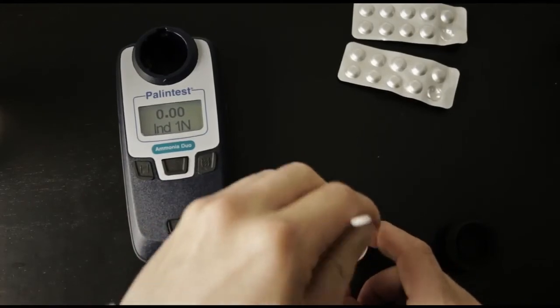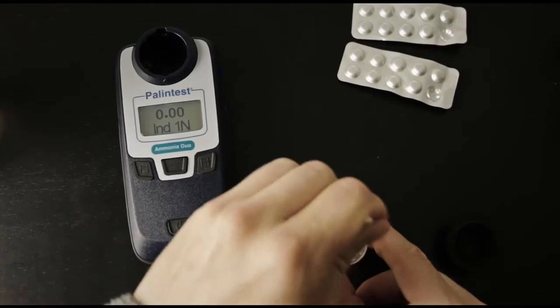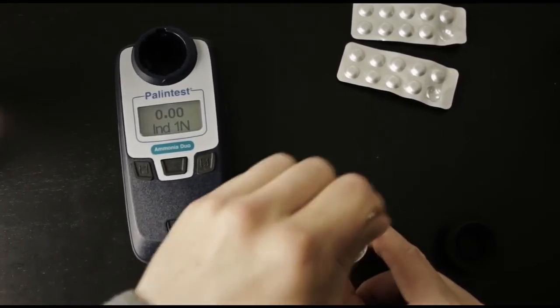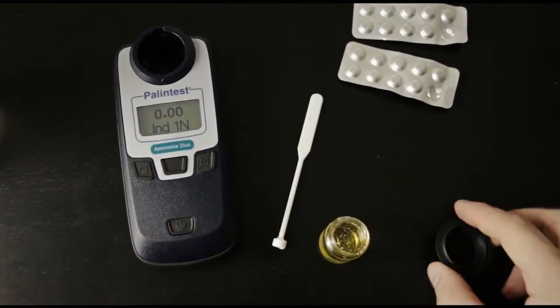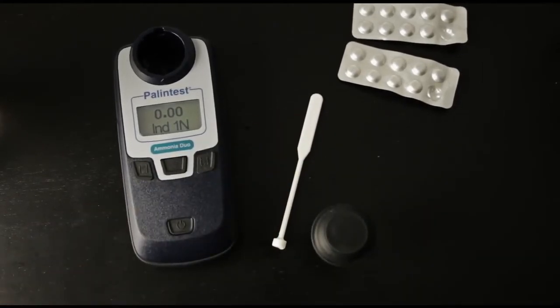Crush and stir these as well, and make sure that they are completely dissolved. Cap the cuvette and let it sit for 10 minutes to develop color.